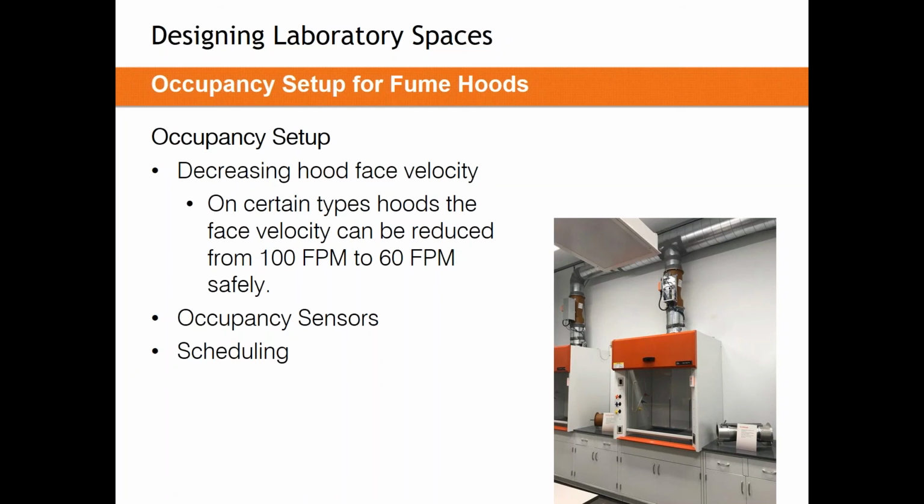Now, in saying all of this, it's important to note the safest fume hood in the world is a closed fume hood. The best way to operate a fume hood, to keep it safe and to keep it as energy efficient as possible, is to close it. You and I on the call here today don't have a lot of control over that. Facilities directors have some control over that.